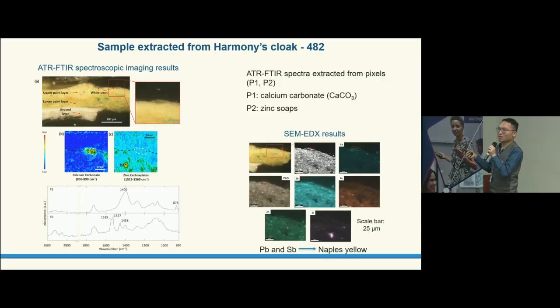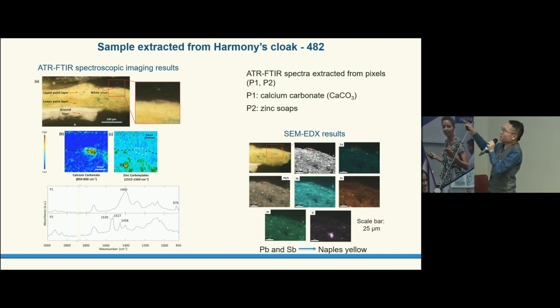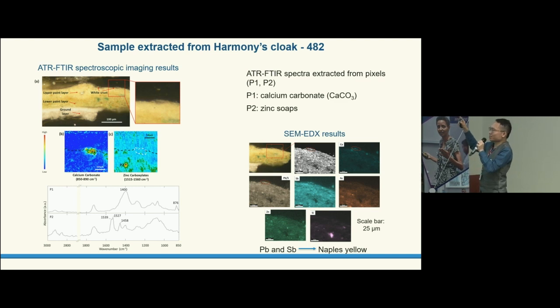Yeah, we really had a discussion with the reviewer of this paper, because they doubted the identification of antimony, since the characteristic X-ray of antimony is very close to calcium, so they may have misunderstood. But we looked carefully at this element, so we are pretty sure that it is the detection of antimony.